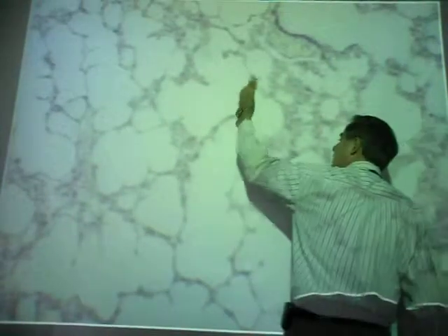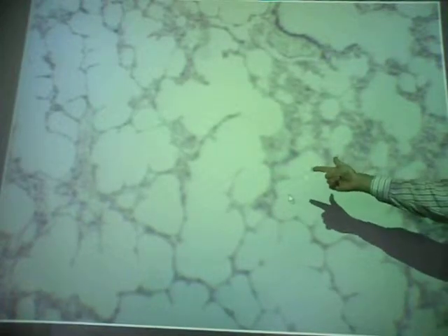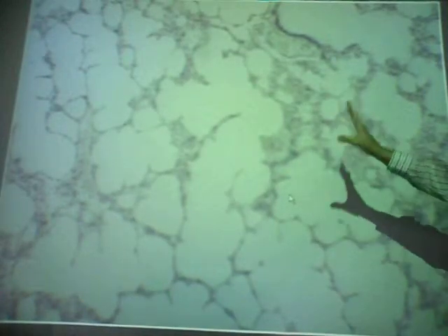Now, mostly what you're going to see are a bunch of alveoli, clusters of alveoli called alveolar sacs, and some of these that have passageways, like you're seeing here, for example, the alveolar ducts. In all cases, what you have are a lot of alveoli. This is where gas exchange occurs between the blood and these tiny little air sacs, okay? We're in the respiratory zone here. And remember, you have a conducting zone and you have a respiratory zone. The conducting zone ends with what?